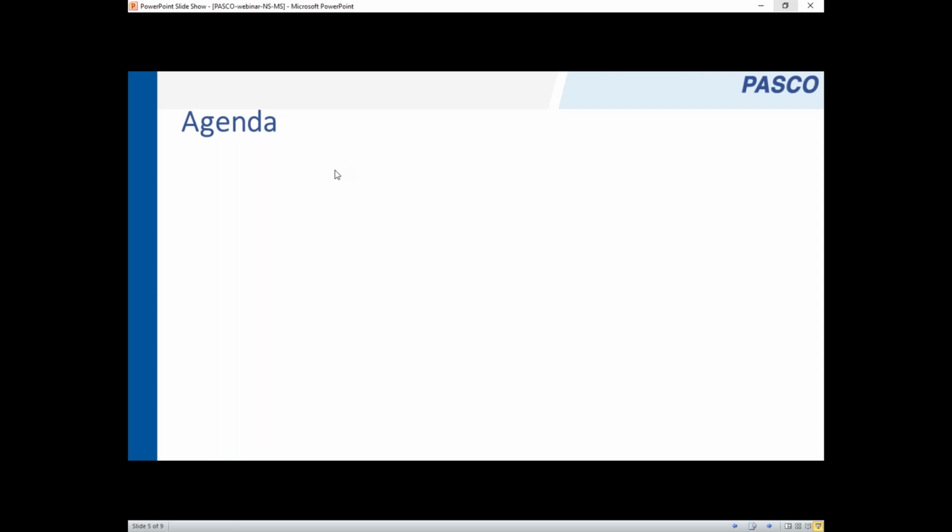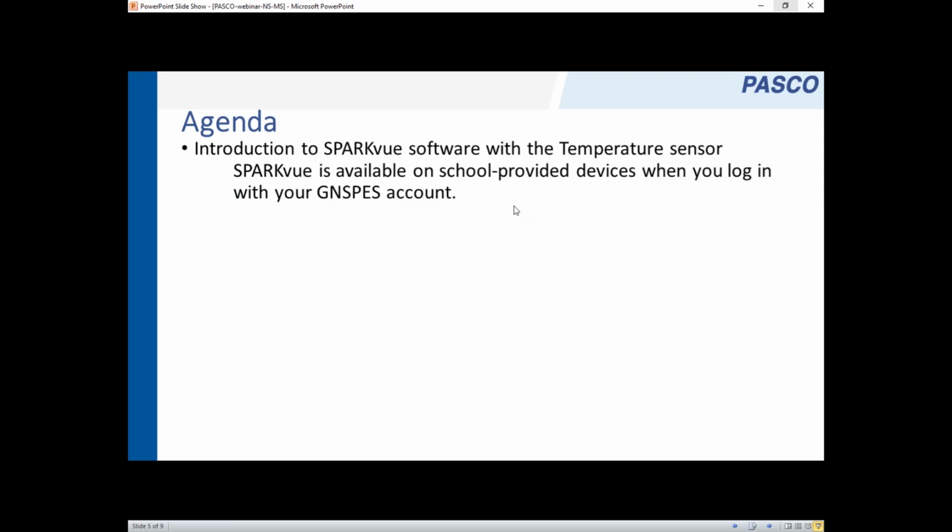Okay, here's what I hope to cover today. It's kind of an ambitious agenda, and you may have gotten an email that if you'd like to participate, you're welcome to, and I had asked to bring sensors and some equipment, and I'll talk about that. Or you can just watch and learn. It's your call. The first thing we're going to look at is the temperature sensor. And I'm going to share my webcam. Give me 1 second to do that.